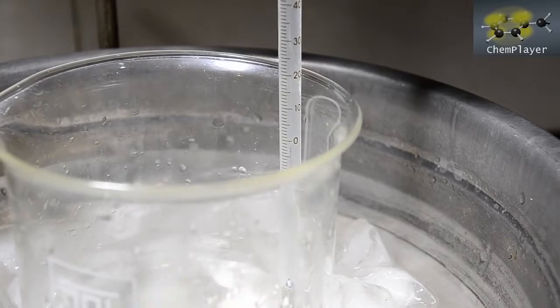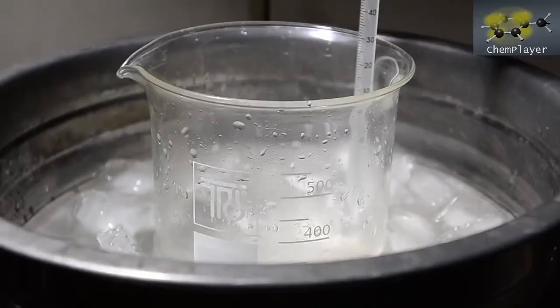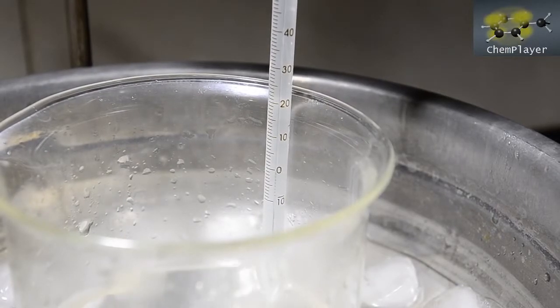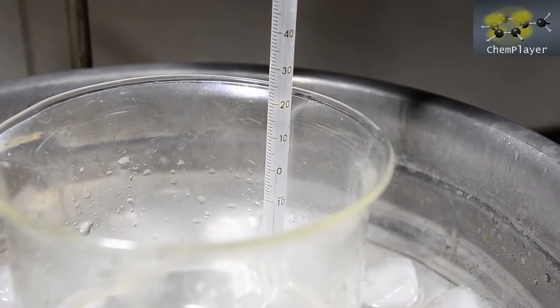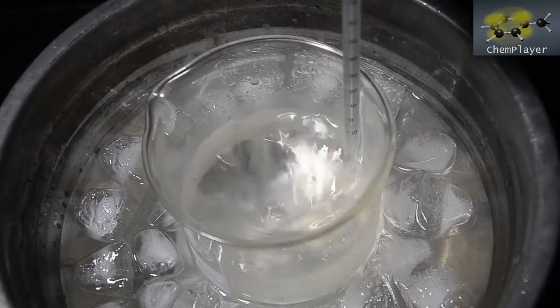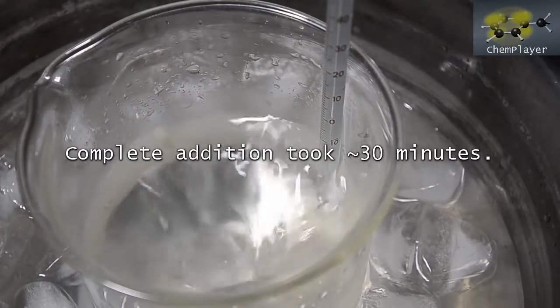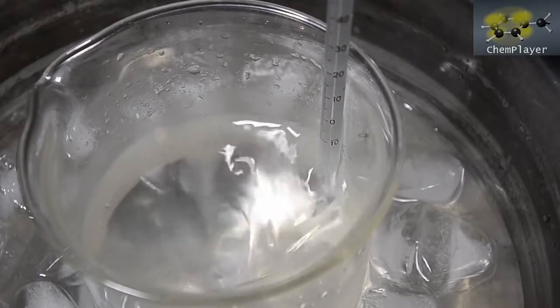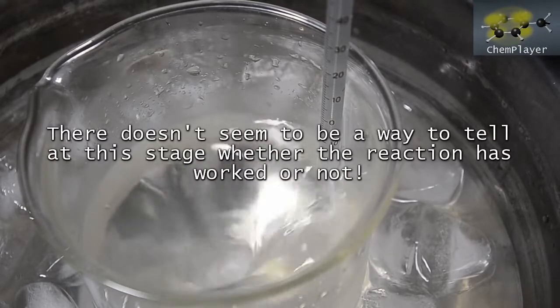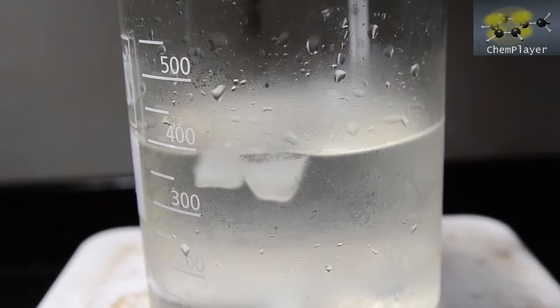Temperature still at -2 degrees C, so this is looking good. Towards the end we added a couple more ice cubes to keep the mixture below 0. Here we go. Complete addition took about 30 minutes, and at the end we've still got some ice floating around in here. There's not really any sign of the reaction taking place at all. We let the mixture stir for another 20 minutes, and then removed it from the ice bath.